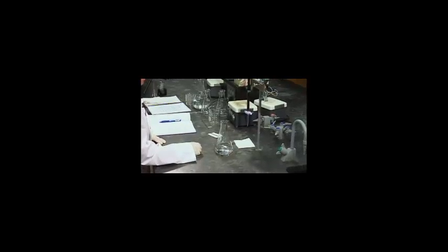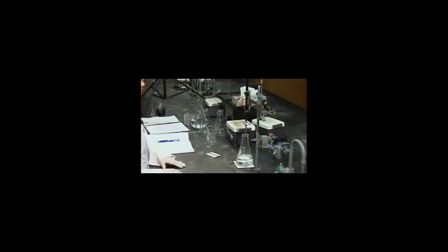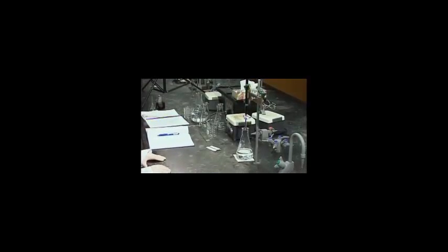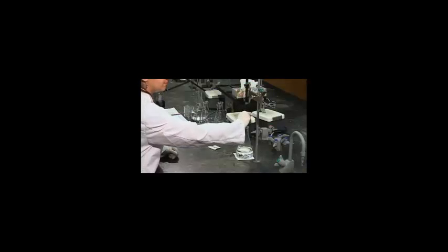In step 6, we're going to titrate our solution with our KMnO4. And we can quickly add our 90% consumption. In my case, it will be about 30 milliliters, but your calculation will be done in your pre-lab.